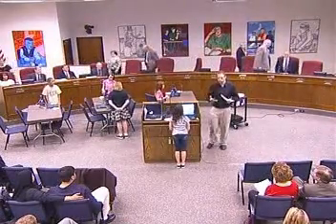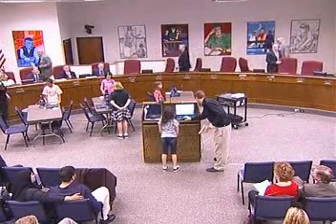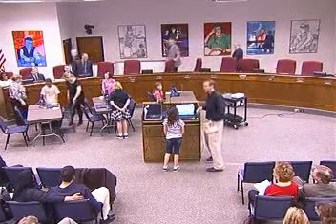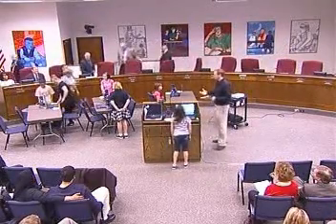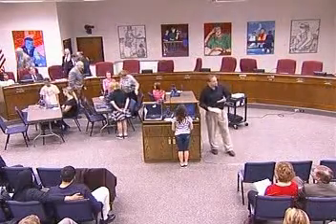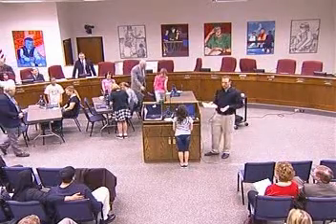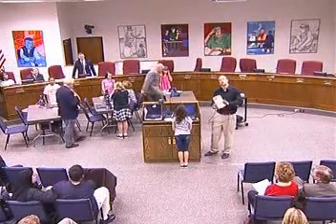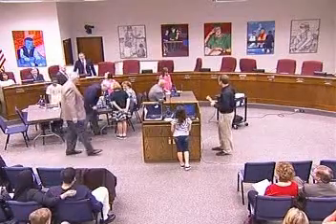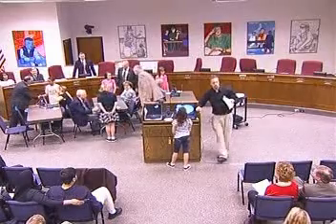These are computer microscopes. They hook up right to the laptops, and we can fit four or five kids around a laptop. Where before we had a microscope where one person could look in it at a time, a whole group of kids can get together and learn cooperatively, which is another research-based strategy from the book, cooperative learning, and it's really great.